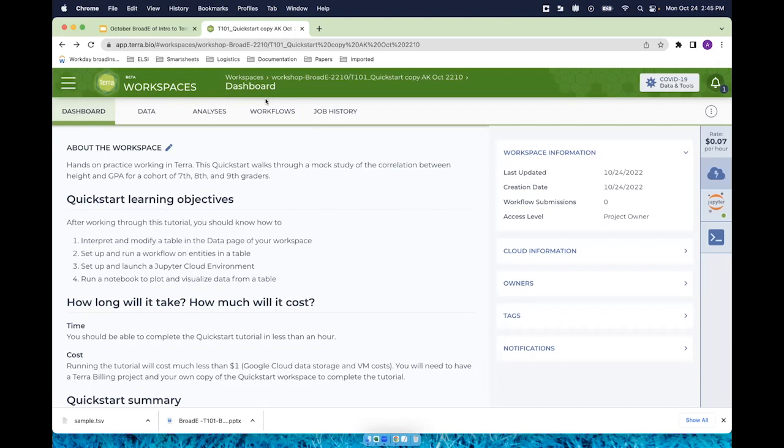Okay. So yeah, that would be my recommendation, is to start with the defaults, and then definitely if you want to see some other examples, you can check out our featured workspaces to see how things are sized. Awesome, thank you. Thanks, Tiffany.